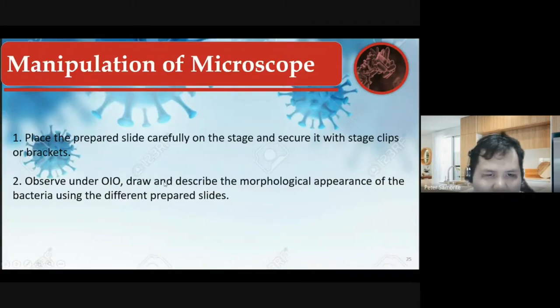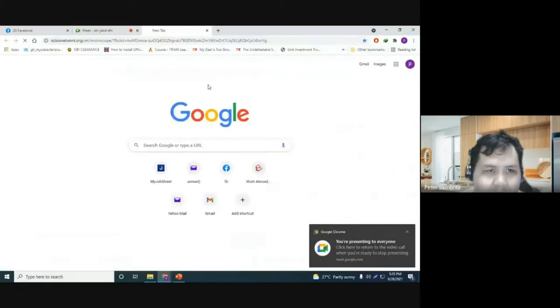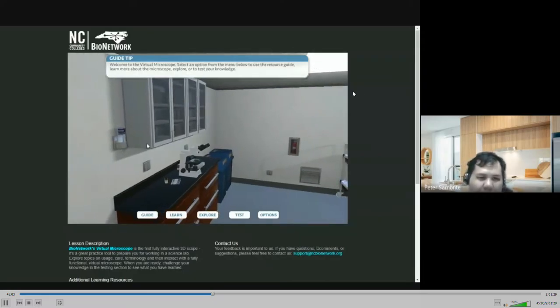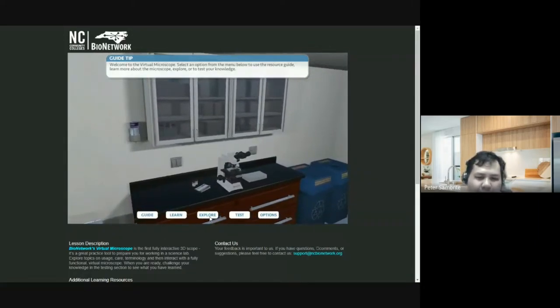So I'm going to show you, class. I'm just going to show you something. I'll discuss that later. So this is a virtual program that will deal with your microscope. So let's try exploring it.